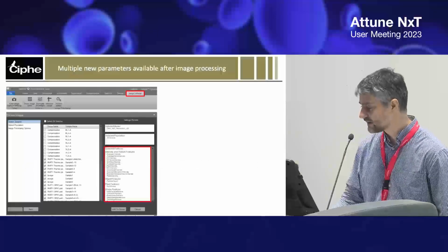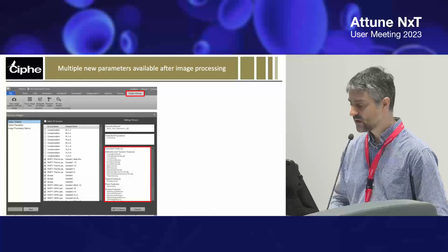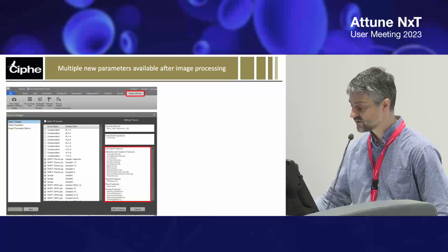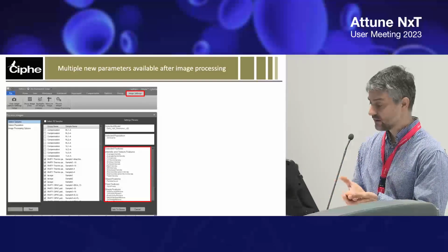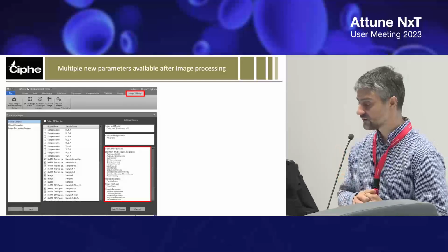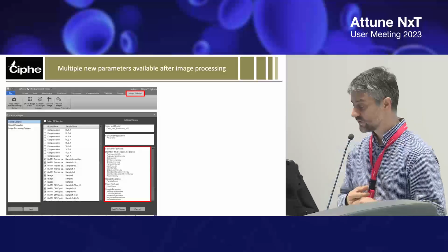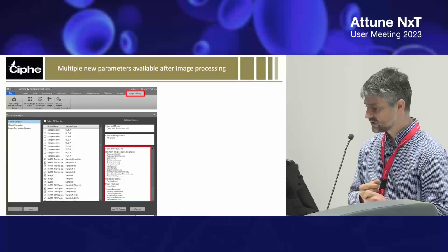We'll see. But just talking about these advanced new derived parameters, when you do your image analysis, you get all that out. Some parameters explain the bright field intensity that you see, some look at how the peaks of signal are distributed, for example kurtosis and skewness.